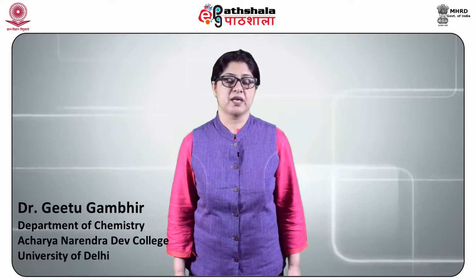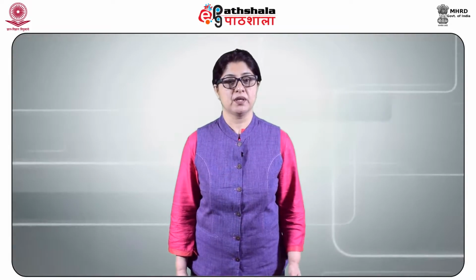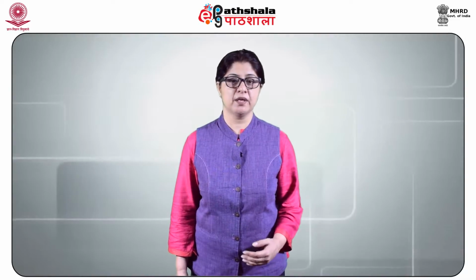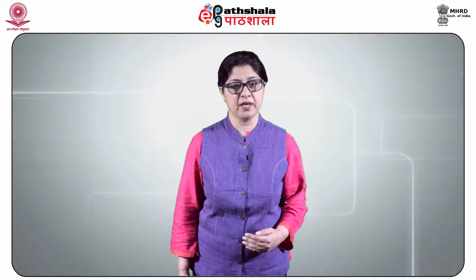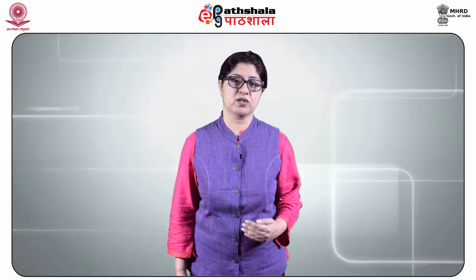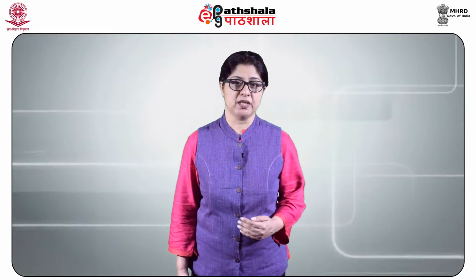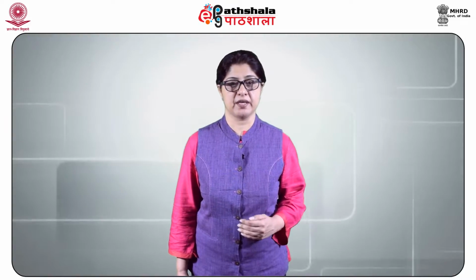Dear students, after studying this module, you shall be able to know about gas chromatography, advantages of gas chromatography, principle and instrumentation required for gas chromatography, and finally the applications of this chromatography. Gas chromatography (GC) is probably the most utilized of all the chromatographic techniques.